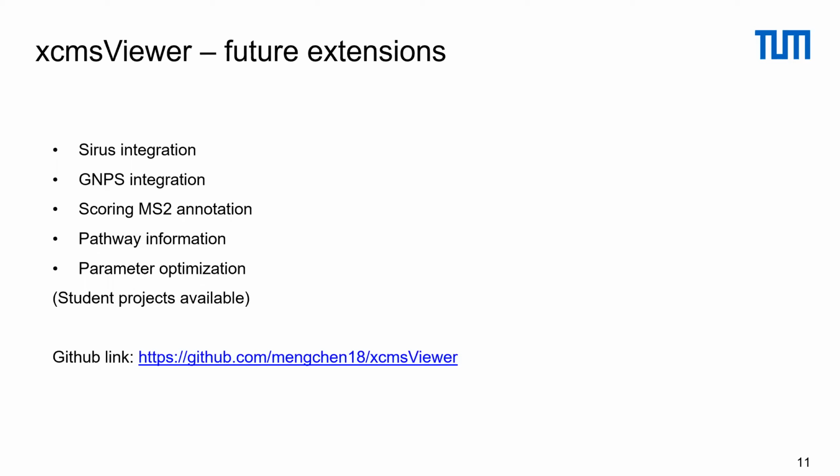But maybe Chen, you want to comment on GCMS and XCMS Viewer? No, unfortunately, I didn't check GCMS data on this. I guess very likely there will be a problem. But could XCMS process GCMS data? Do you know that? I tried that with our machine, but I could not convert the data into the format I needed.